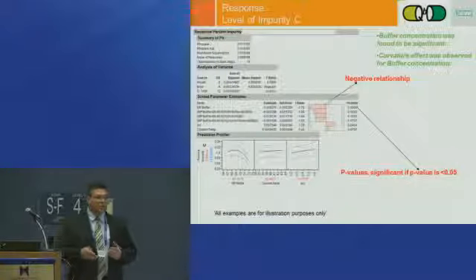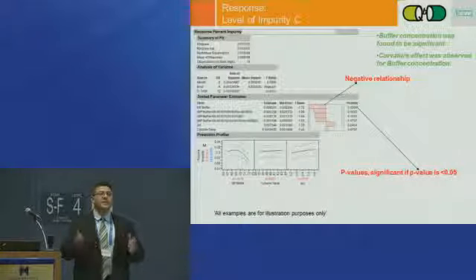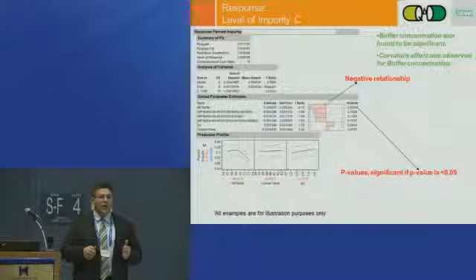So for example, just say your resolution, you did see an impact of resolution and it changed from 3 to 3.5 when the pH changed over X value. Well, that's okay. You don't need to have a control strategy for that because the resolution is so wide that it's not critical. The magnitude is not big enough. Now, on the other hand, you have resolution changing from 1.1 to 1.4. Well, you know what? That's significant and of a big enough magnitude where you need a control strategy.